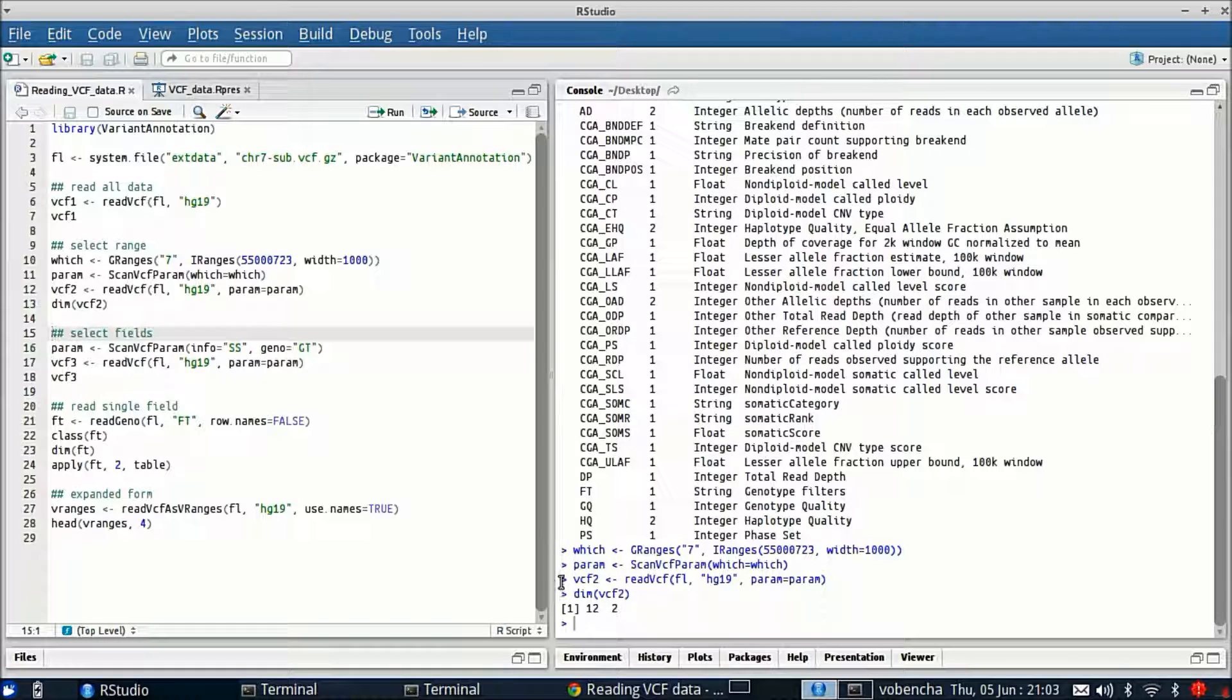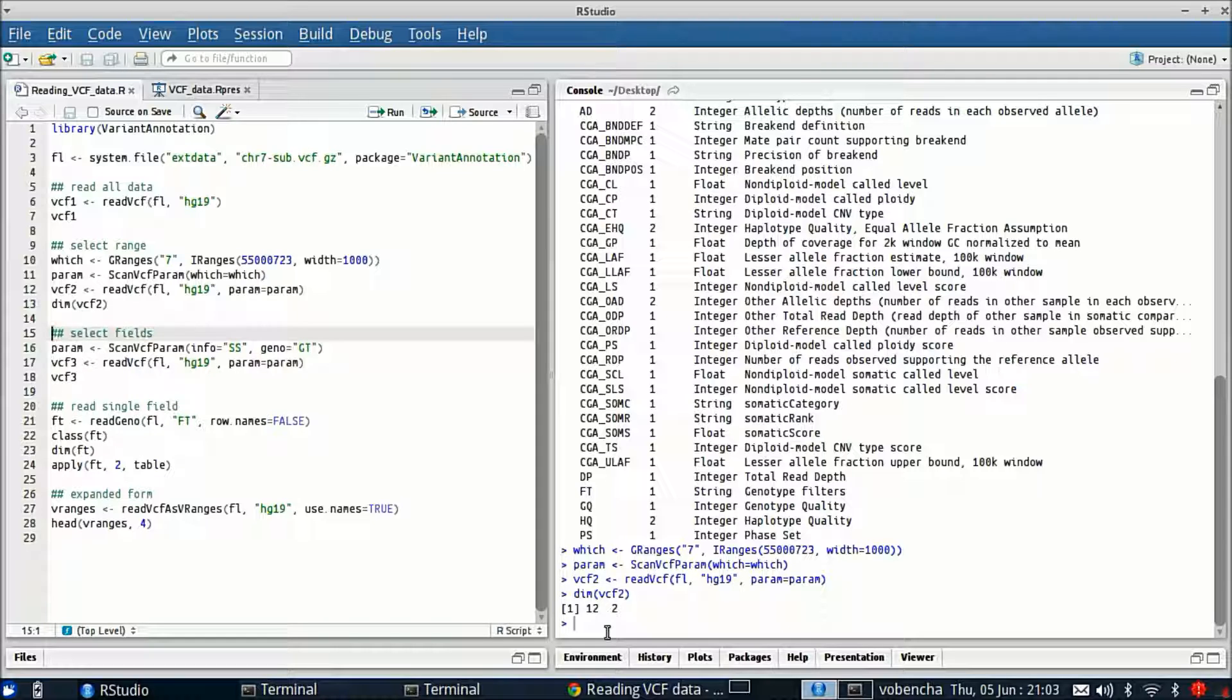You can see our dimension is much reduced. We had almost 4000 rows before and now we've only got 12 by 2. If you know the ranges of the variants that you're interested in, this is a good thing to do to get a focused subset of your data.